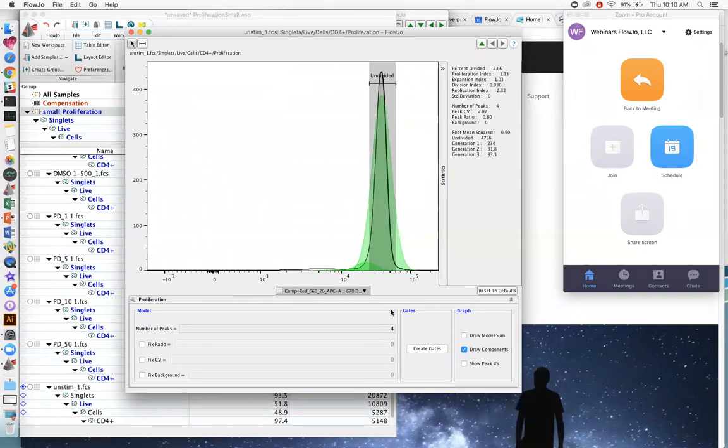We'll touch this number a little bit later, but that's what the other generation statistics here are telling you, that you have roughly 234 cells in the first generation and then about 30 in the subsequent ones. We won't worry about those numbers too much yet.